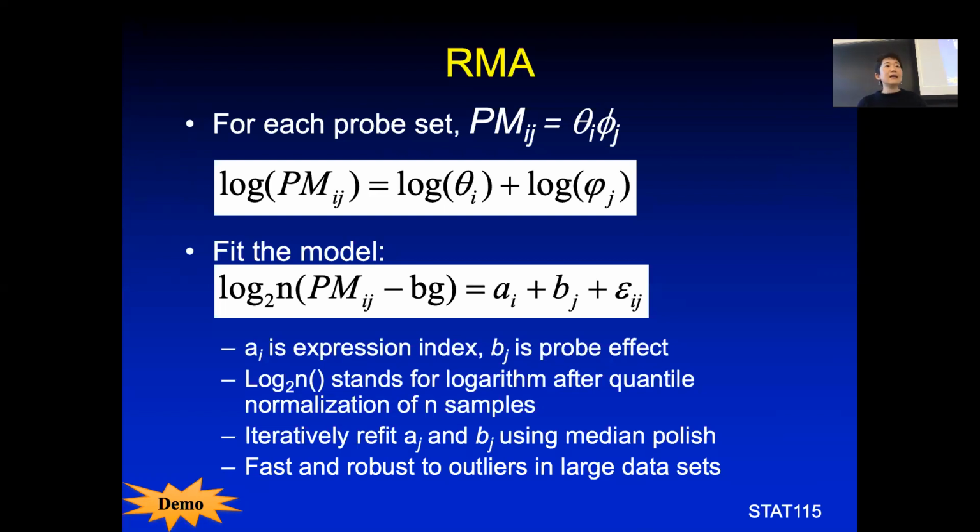Yeah, so at the end, the mismatch probes were not considered. In fact, because of RMA, in the later Affymetrix design, Affy decided not to design mismatch probes anymore. For the background, they just look at the overall signal. They assume the noise at every location is kind of normal, and they can estimate the parameters for the exponential and the two parameters, the mean and the standard deviation, for the background. And then given any probe value, it will give you the estimated signal, subtracting the noise.